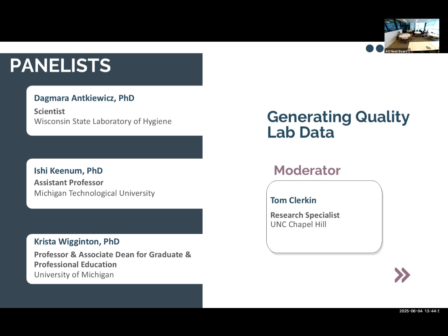How about you, Dagmara? I don't think there's one size fits all, and there's not a standard. Unfortunately, basically you need to look at your data and then decide if any normalization is helping. That slide that I provided to you in an email, like we were thinking we were going to be talking about this, is from when we did an analysis in my lab of 24 or more different permutations of treating your data.